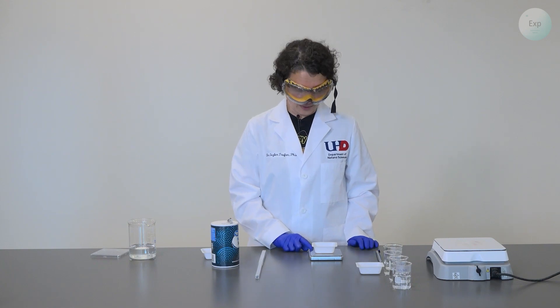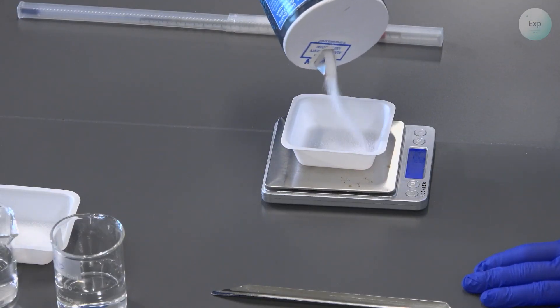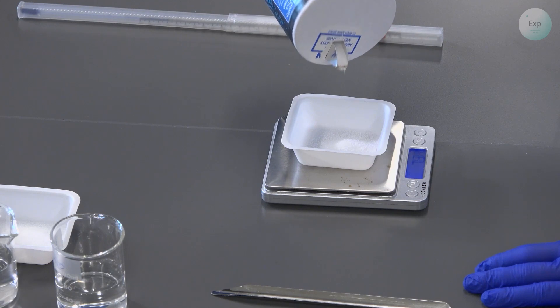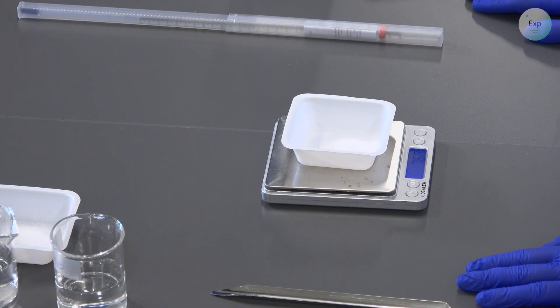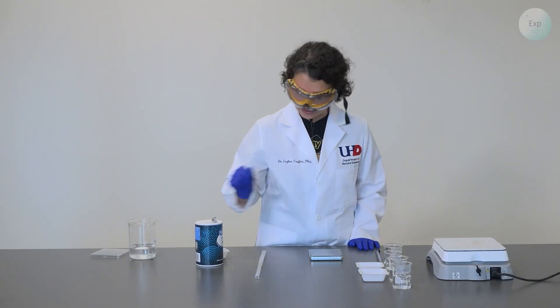Next, I will add a weighing boat on my scale, tare the mass, and add 7.5 grams. It is a little bit over at 7.68 grams. This will go in my third beaker.